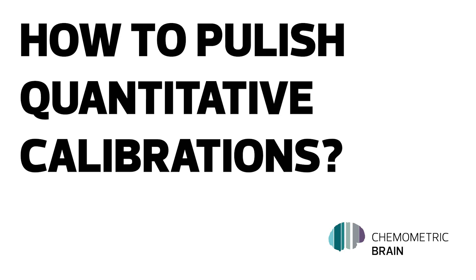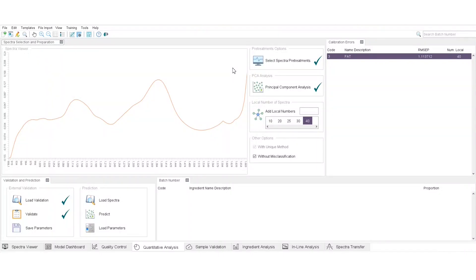How to Publish Quantitative Calibrations. Once the quantitative calibration is created and saved, you can publish it in order to make it accessible for a customer and its device. These are the steps to follow.